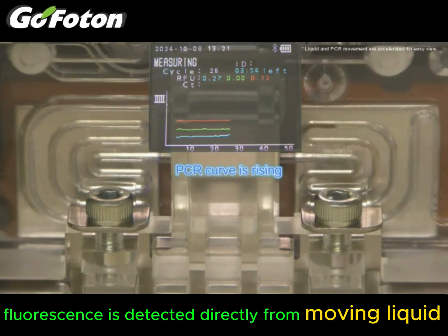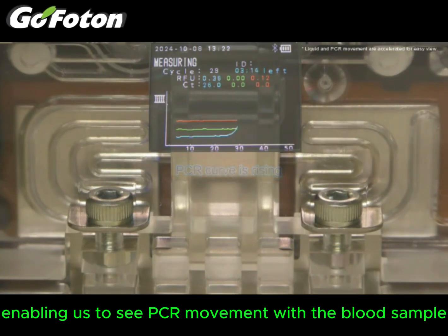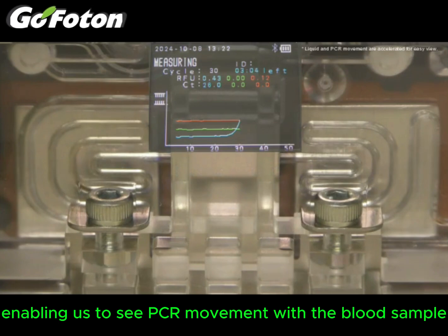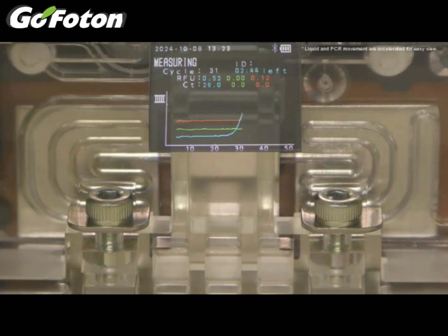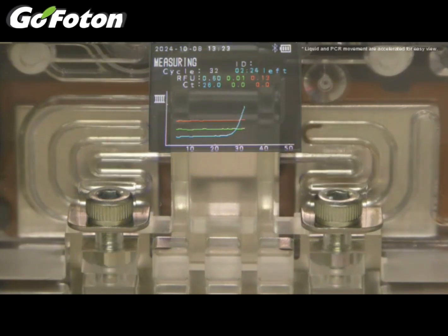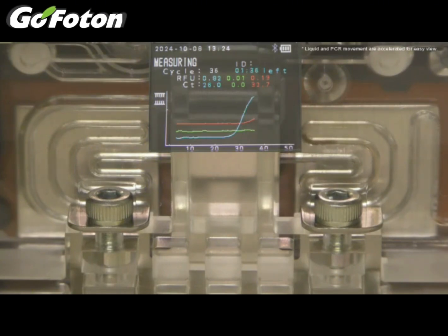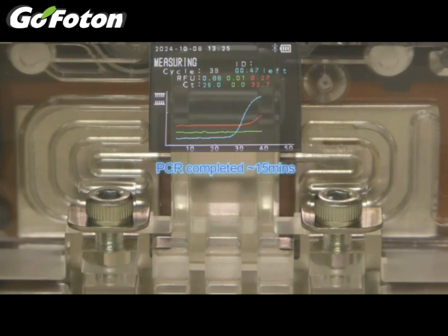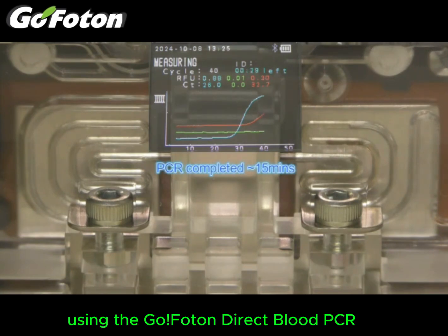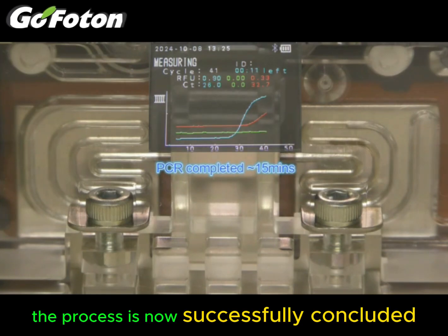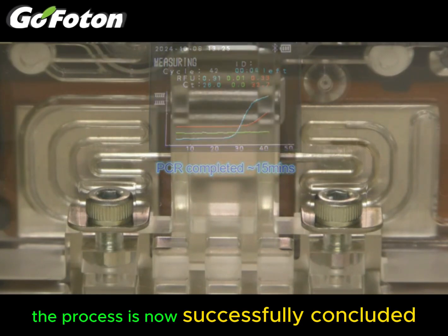Fluorescence is detected directly from moving liquid, enabling us to see PCR movement with the blood sample. Using the GoPhoton Direct Blood PCR, the process is now successfully concluded.